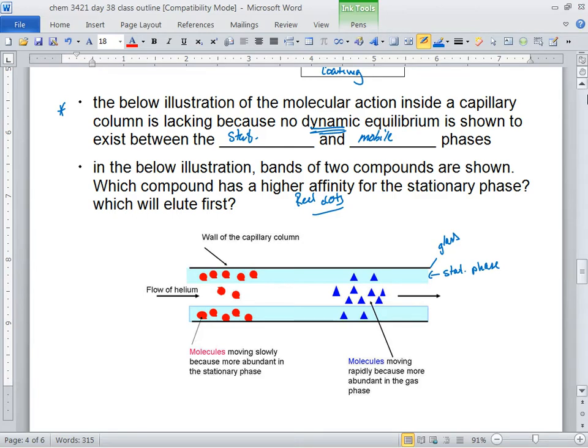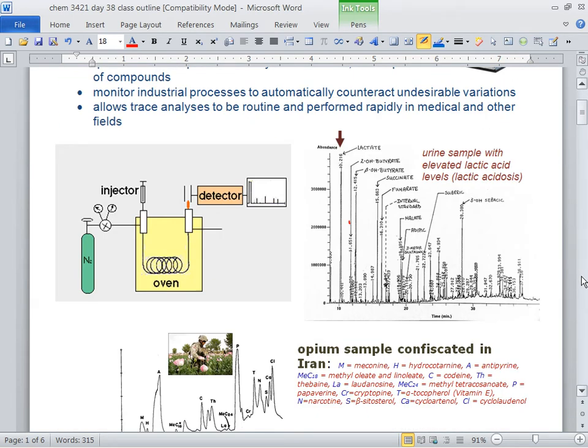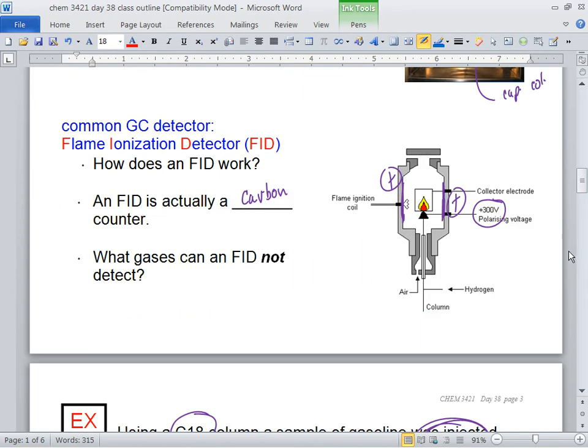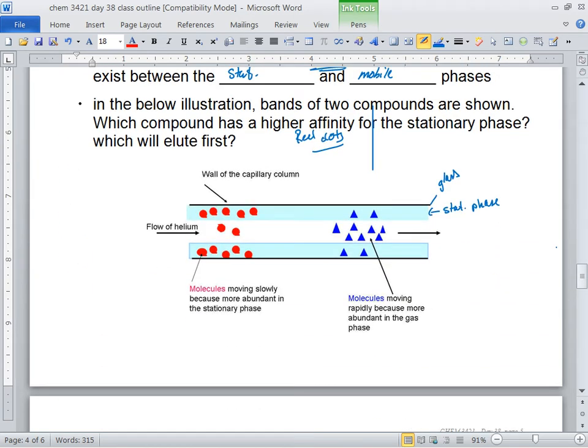Problem with the mobile phase, and it wouldn't really matter anyway, because the mobile phase, its sole purpose is to push everything through. And then that mobile phase, all you got is this big cast iron tank. It wouldn't be worth the effort to change it, and the effect of it wouldn't be that helpful anyway. Just the temperature, then? Temperature. That's it. That's what I'm trying to get you to ingrain in your brains here. You mess with temperature in gas chromatography if you want to change the partition and get more into the mobile phase.